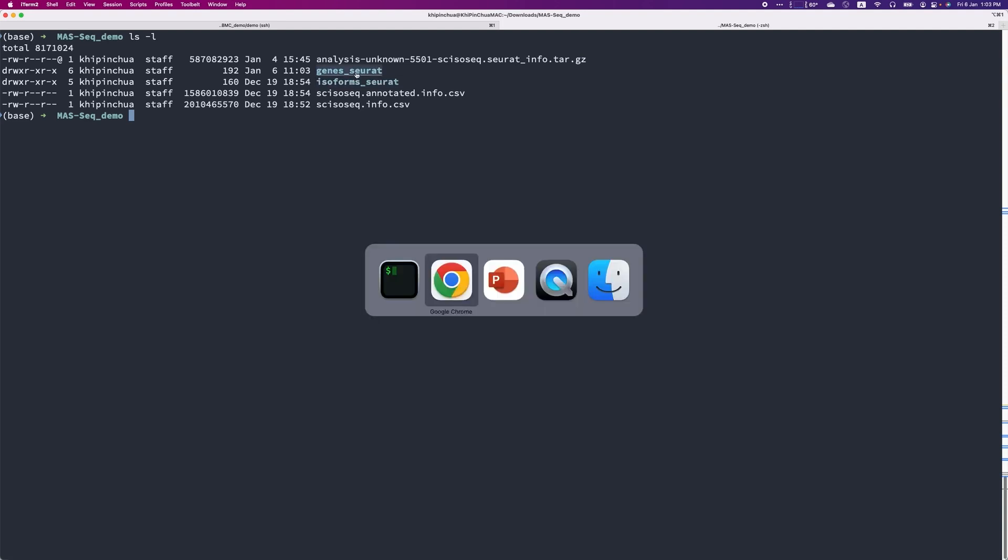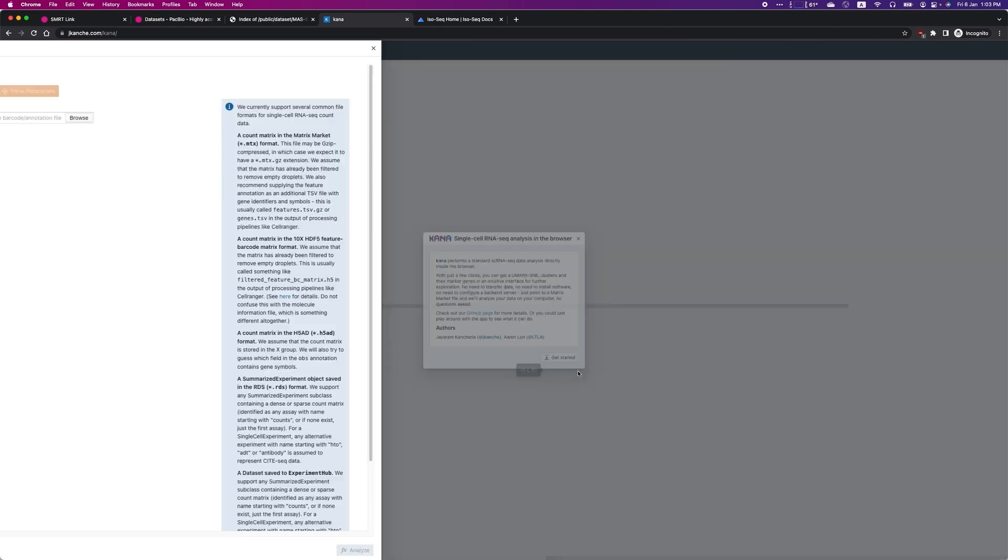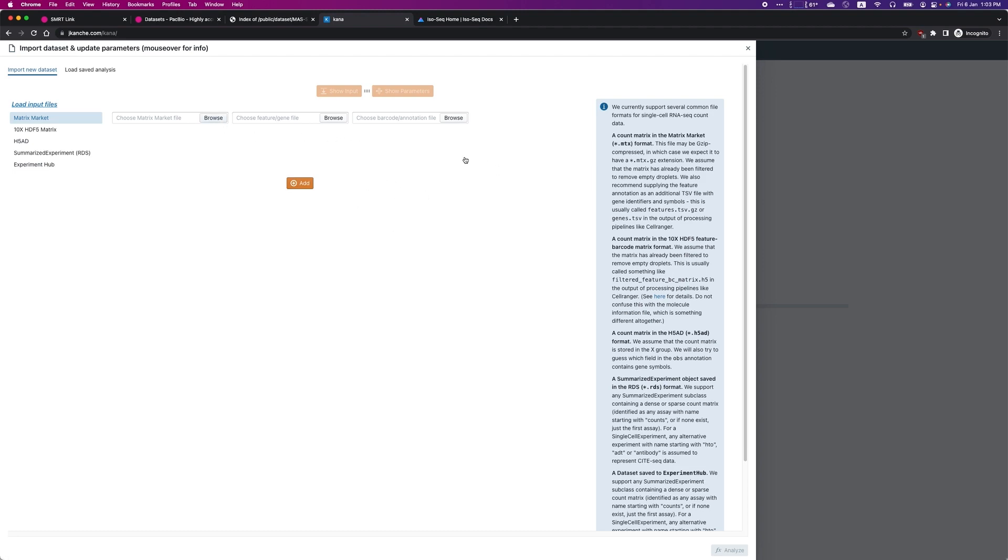Here is an example of using the matrix with a fast web browser single-cell analysis tool called Kana. Kana takes in standard matrix market file, so we can easily load the SmartLink 11.1 results onto it.